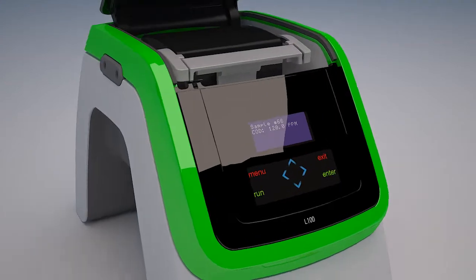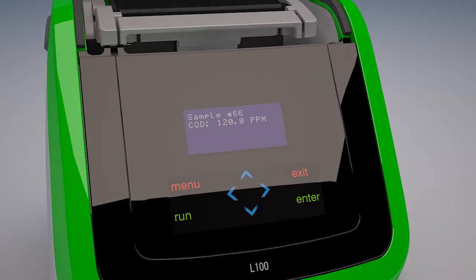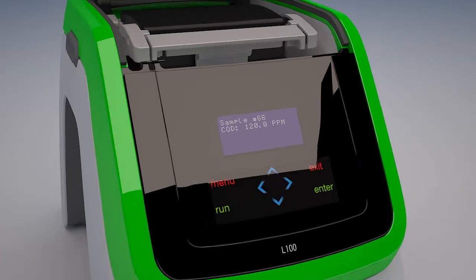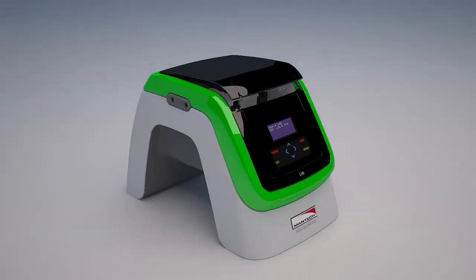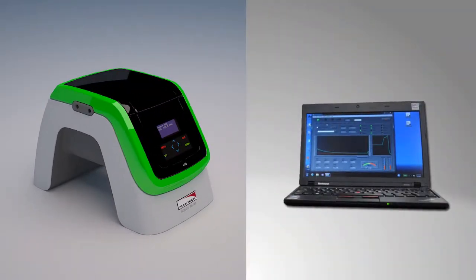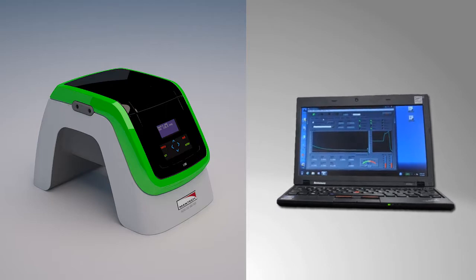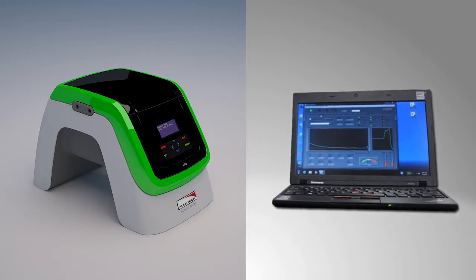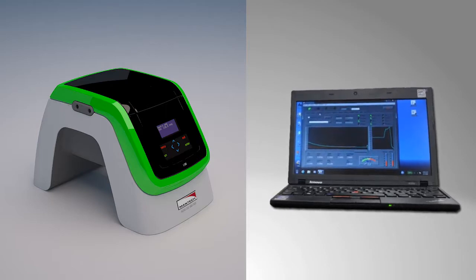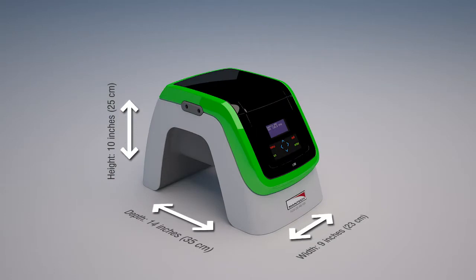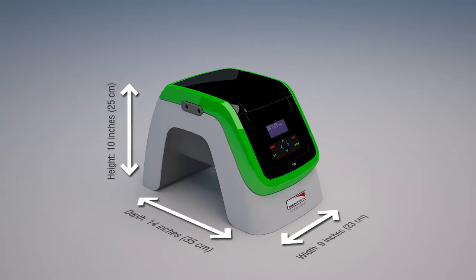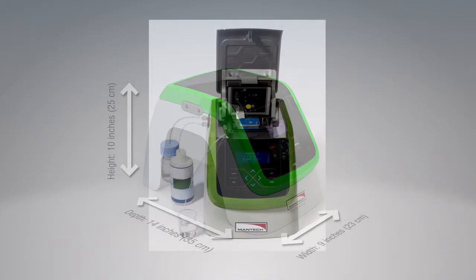PCOD offers an easy-to-use click-and-go interface menu, enabling its use by facility operations staff members in addition to laboratory technicians. Enhanced software options enable additional functionality, parameter sampling, and automated reporting. The unit has a small footprint, requires minimal bench space, and can be used as a portable field unit.